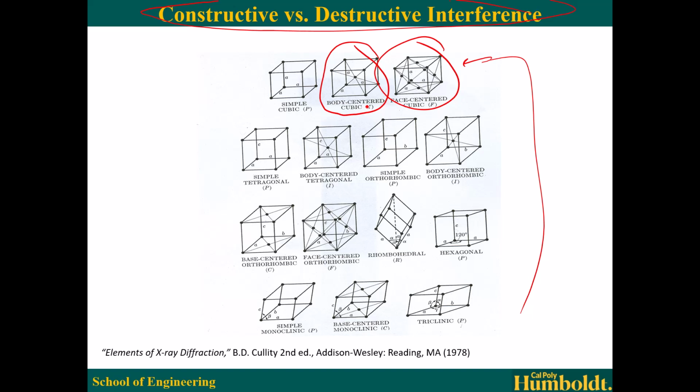So our 3 lattice parameters are all equal, and our angles alpha equals beta equals gamma equals 90 degrees. All of our lattice parameters have the same magnitude. All of our interaxial angles have the same angle, and this is obviously different from triclinic.